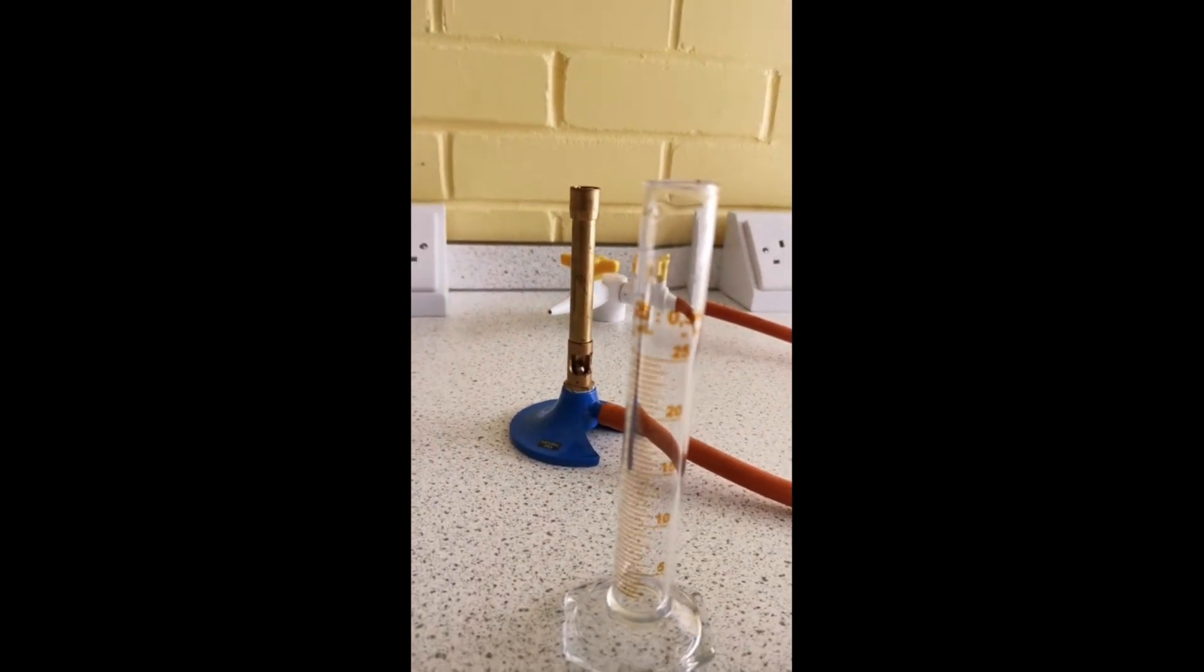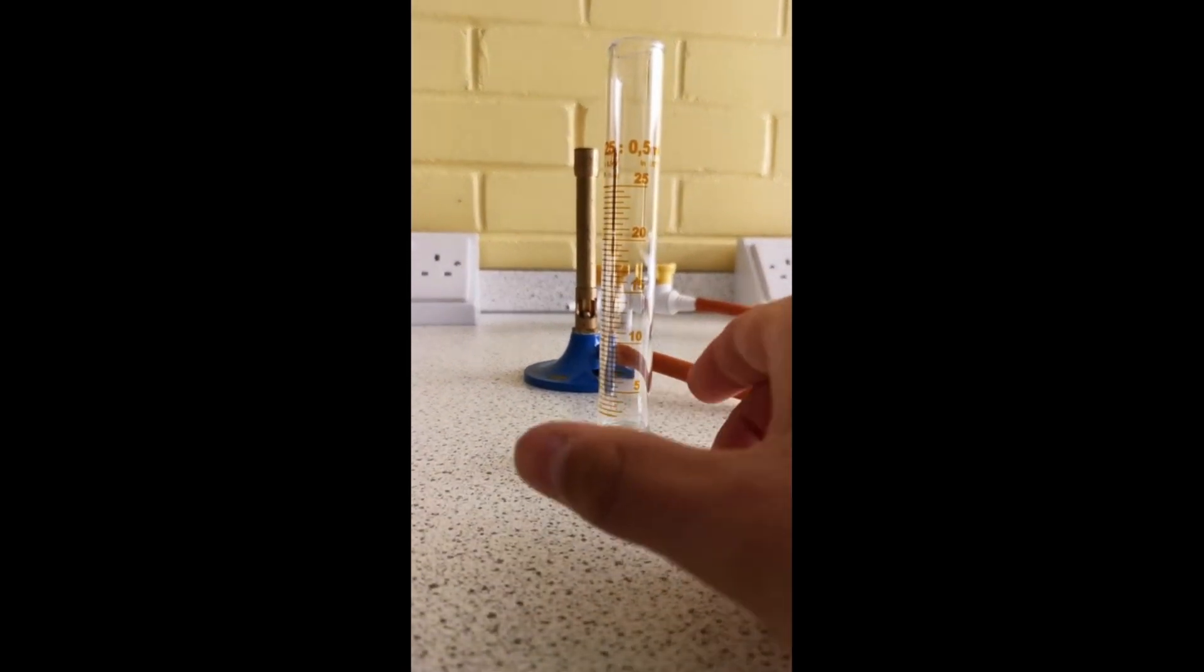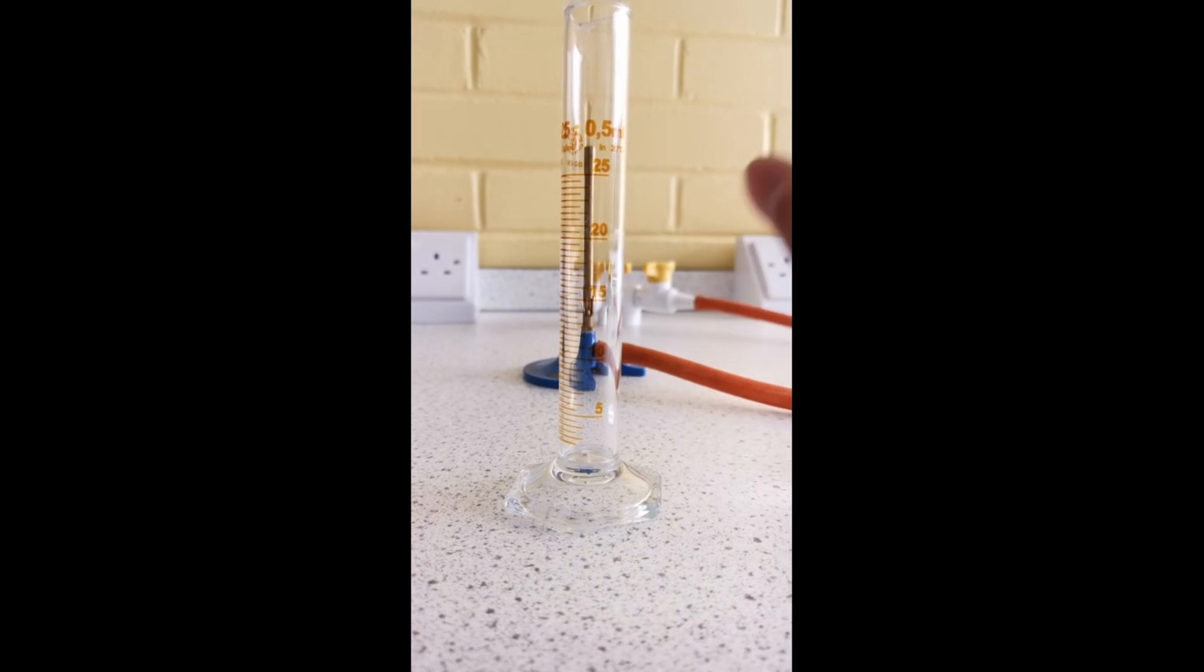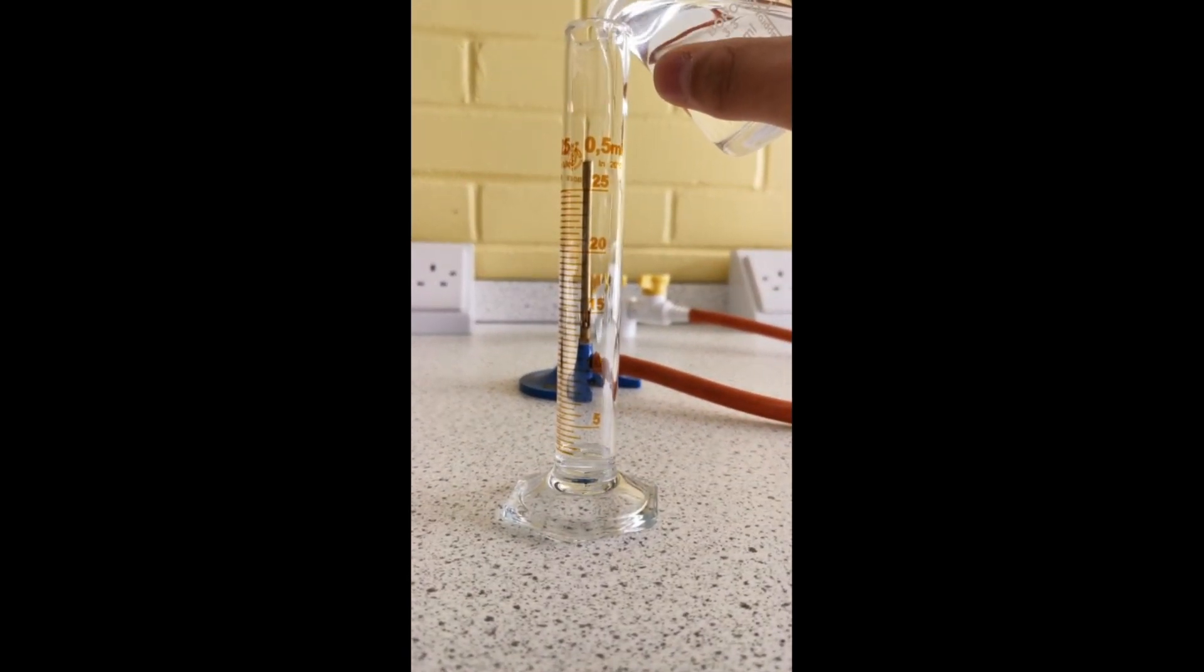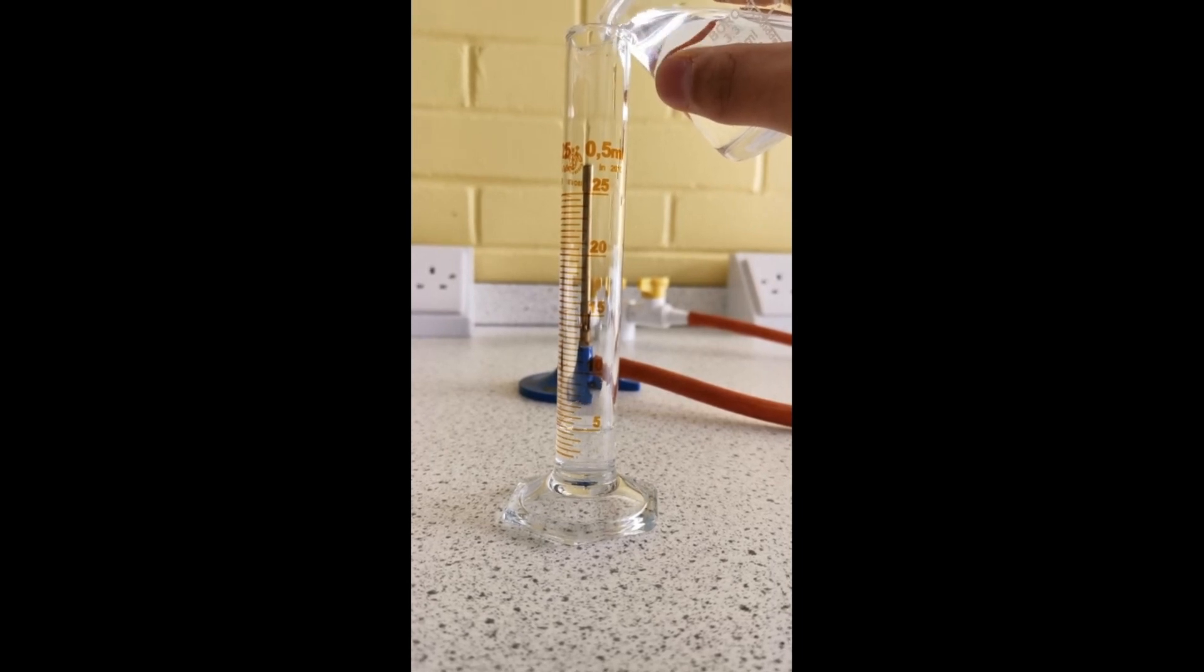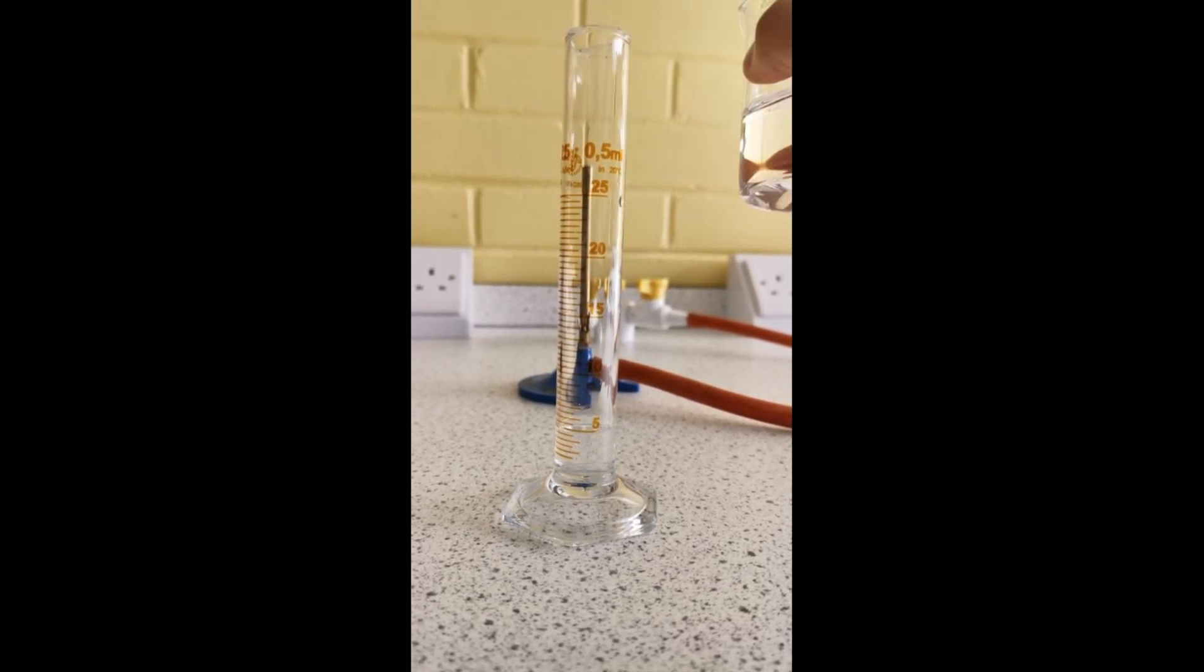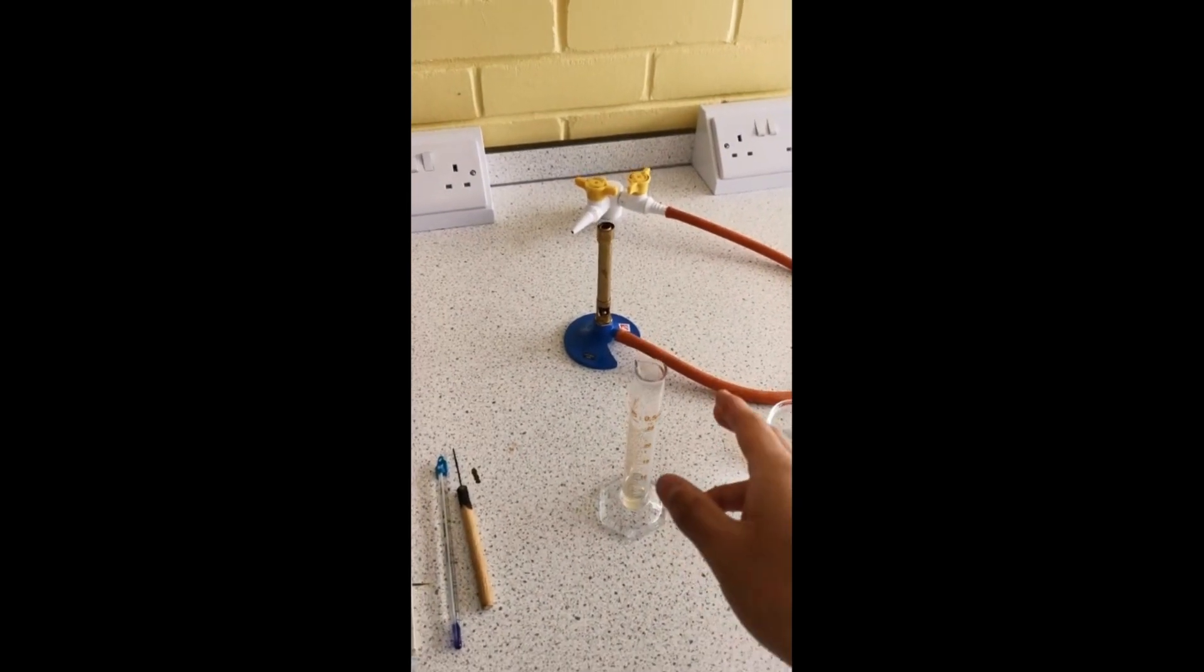I've got my water in the beaker. I'm going to go down to eye level. Here's the five. I'm going to very carefully pour in the water until it reaches the five mark. Perfect, so that's our five milliliters of water.